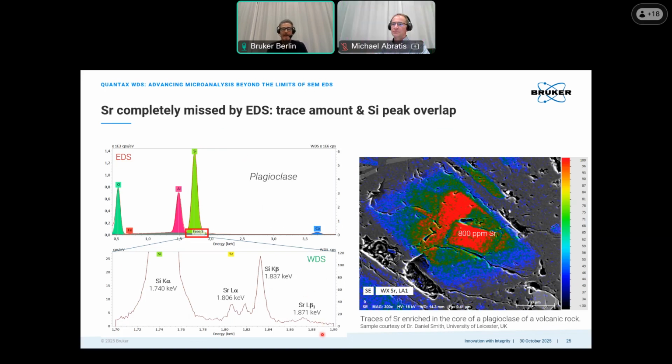So that Bruker WD spectrometer is specifically designed for the lower energy range, which can cover a range up to 3.6 or 4 keV. So since it works with an X-ray mirror optic, we cannot go beyond that energy range, even when we change the diffractors.